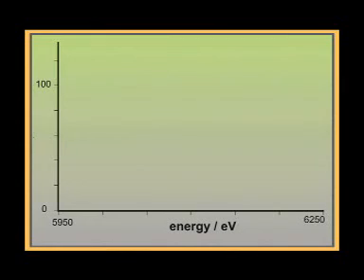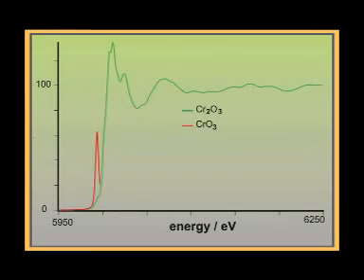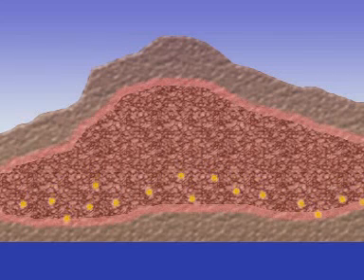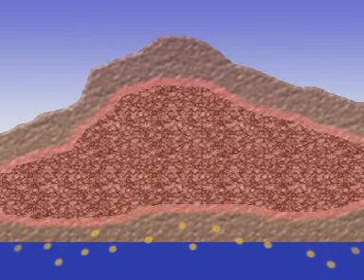The spectra also show the oxidation state in which atoms happen to be at that moment. Whether a metal remains immobile on a landfill site or may be washed out by biological processes depends on its oxidation state.